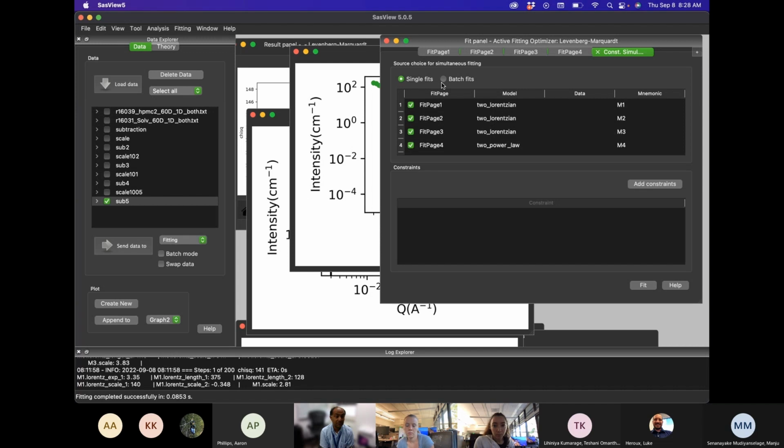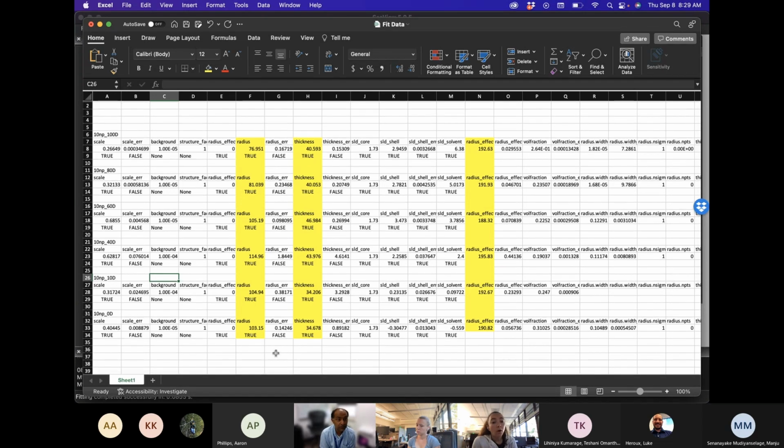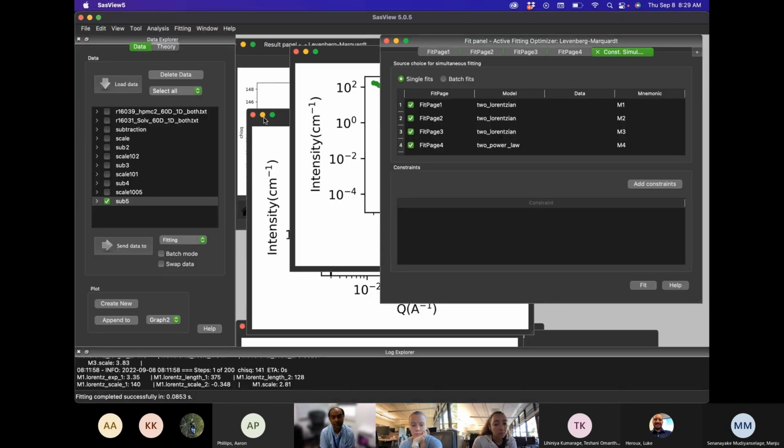Right now, 76 angstroms to 115 angstroms, right? 75 to 115, that's about 40 angstroms variation. And I would tend to trust these better than the lower ones. I'm not sure which one you're referring to. The 100%. You feel more confident of the 100%, you're saying? Yes. So I would go with this. I think it's better to go that way.